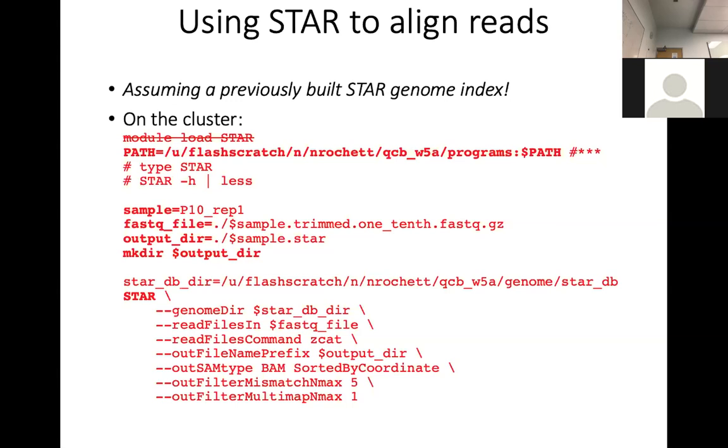So this is the dot, and this is in less, right? So just put this. Yeah, it's running. I'm not sure which one. The help is not really telling which one.